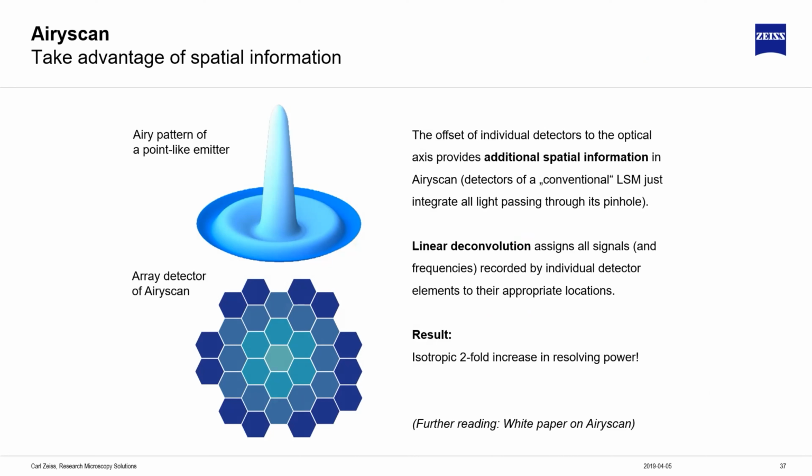And as a result of that, once we have the information from the Airyscan, we do a combination of a Sheppard sum reassignment to basically reassign photons back to where they belong in the pixel. So across the Airy disk, or across the Airyscan detector, we basically put the photons where they belong. And then we do a Wiener filter deconvolution as well, so that in 3D, we're able to basically assign photons to the proper location in space. Both of these processes are linear, both of these are quantitative, so you can quantitate your data the same way that you would any other kind of confocal information.